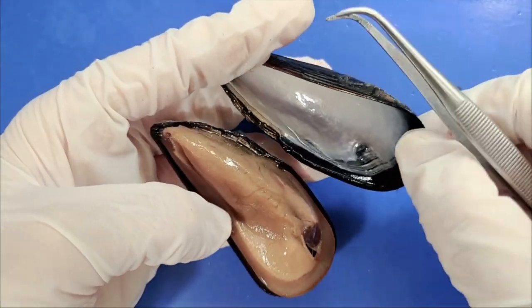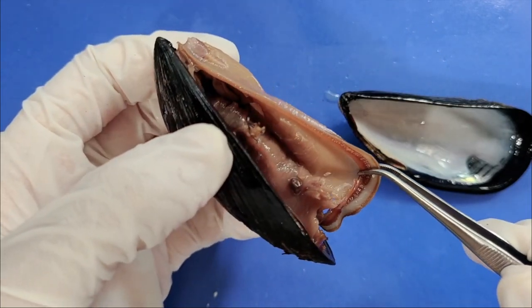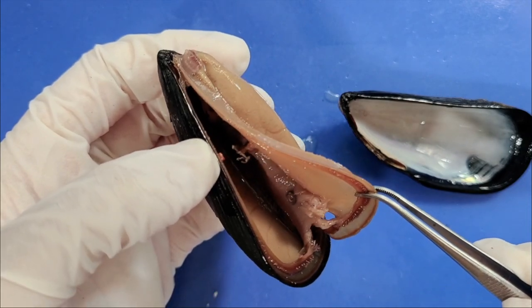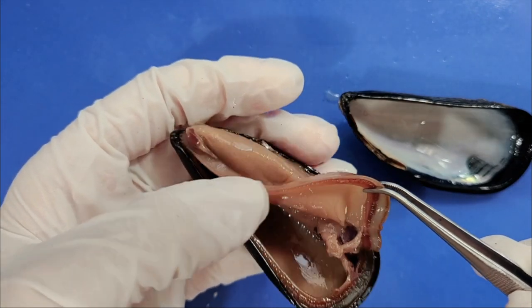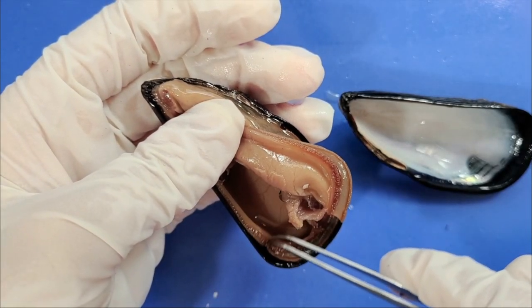So now that we've opened it up, let's take a look at the internal anatomy. This thin sheet here is called the mantle. It's a sheet of cells that makes the shell. The mussel has two mantles, one for each shell — so one here, and you can see another one stuck to the shell around here.